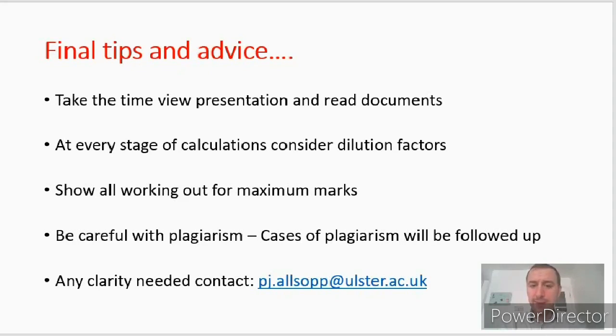So in terms of tips and advice, take the time to view the presentation on the theory of the flow cytometer, and also read the associated documents to help you with this assignment. It's an assignment, therefore you have to invest time to do some background reading. At every stage that involves calculation, always remember to consider dilution factors. And like any calculation, it's important to show each step of your working out in order to achieve maximum marks.